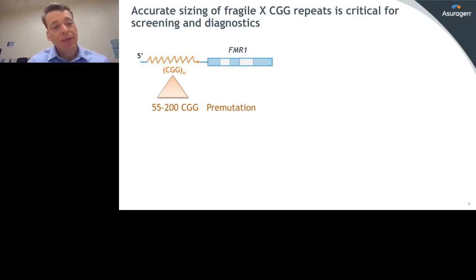More extreme amplification or expansion of the CGG region in FMR1 beyond 200 repeats is known as a full mutation, and that's the cause of Fragile X syndrome, which is the most common known genetic cause of autism and a major neurodevelopmental disorder. It occurs in about 1 in 5,000 boys and girls. And it's important then, across this spectrum, to be able to have technology that can accurately flag full mutation expansions, but then also accurately assign the size of the CGG repeat within the premutation or other ranges. And this is important for several reasons.